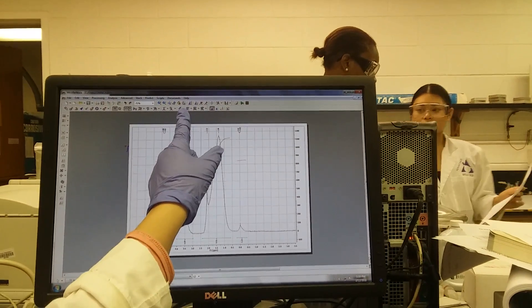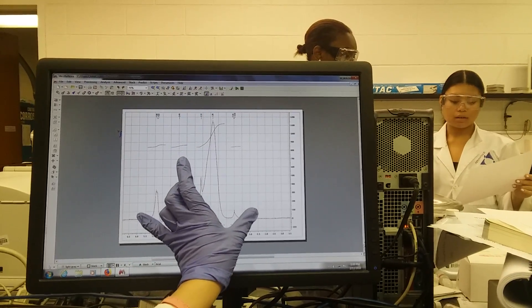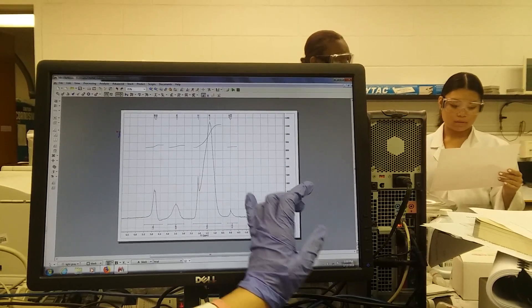Then you're going to go to pick peak, and you're going to go peak by peak. Pick each one separately.